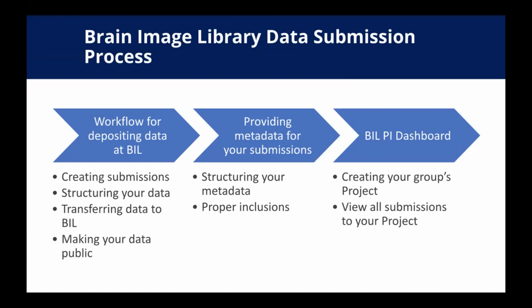So the workflow process of creating a submission at BIL begins with creating the submission, structuring your data, transferring that data to BIL, ultimately making that data public. But in between that, you'll need to provide metadata for the submissions. We'll get into more of metadata structure later on. And I'll also touch on the PI dashboard, the data manager dashboard that we developed for data managers and PIs to have a larger overlook of the submissions at BIL as a whole for your project.